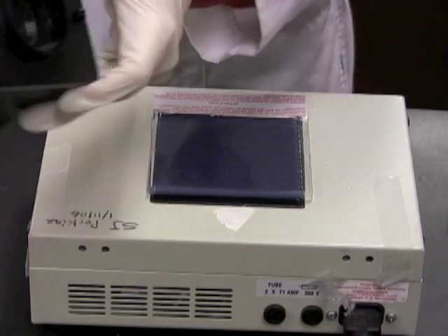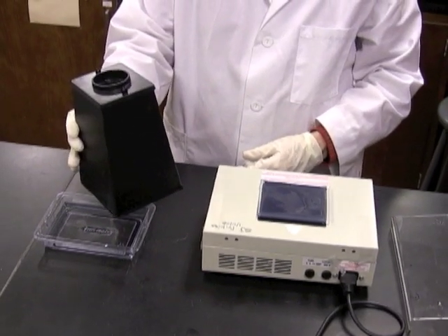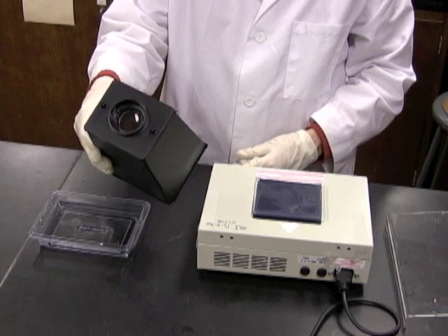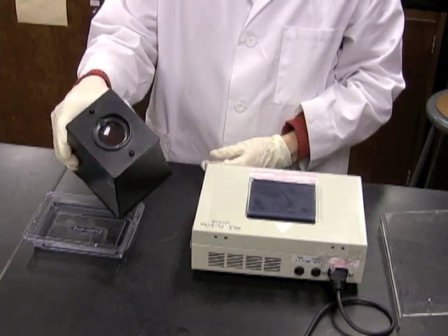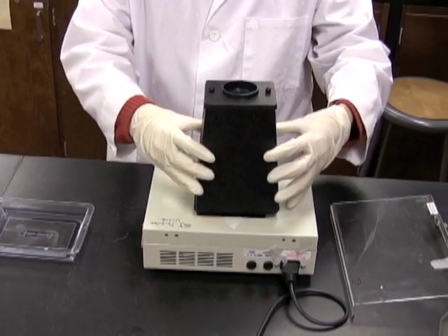To obtain a permanent recording of your gel, you need to take a photograph. For that purpose, you need a hood and a digital camera. Use the hood to make sure that the only light that's reaching the camera is from the UV light box, and also to shield your eyes from the UV light. So first place the hood over the gel.